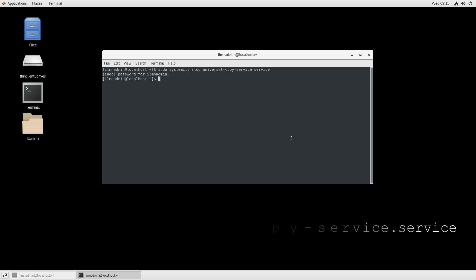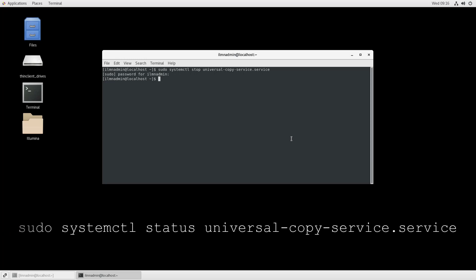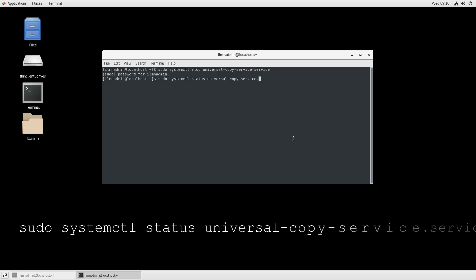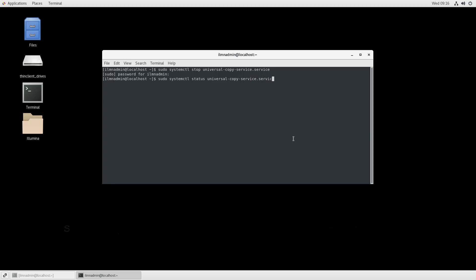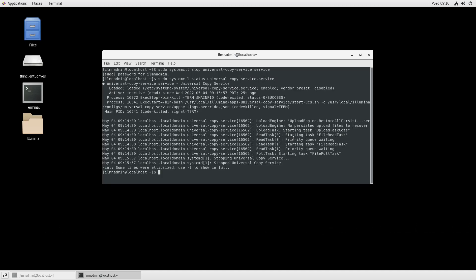To check the status of Universal Copy Service, type sudo systemctl status universal-copy-service.service. The service is now showing as inactive.